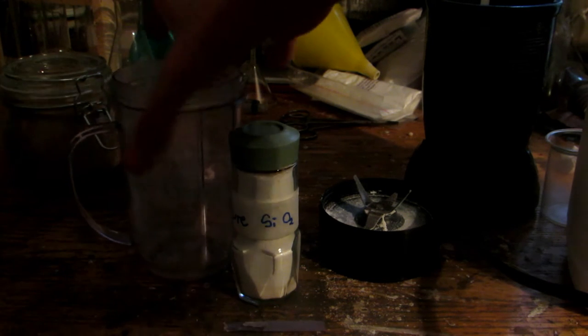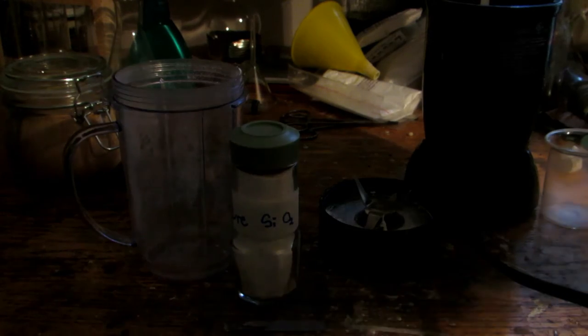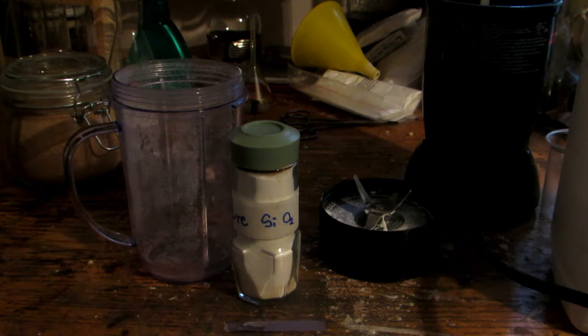When you grind this up together, it is extremely important to do this outside, because powdered sodium hydroxide, if it is fine enough to float around in the air and you breathe it in, it will react with the moisture in your nose and lungs and cause severe burning and horrible pain. Do not breathe this powder in. It's very important you don't do that, because sodium hydroxide forms a very strong basic solution. I'll weigh out the two ingredients and meet you back outside.